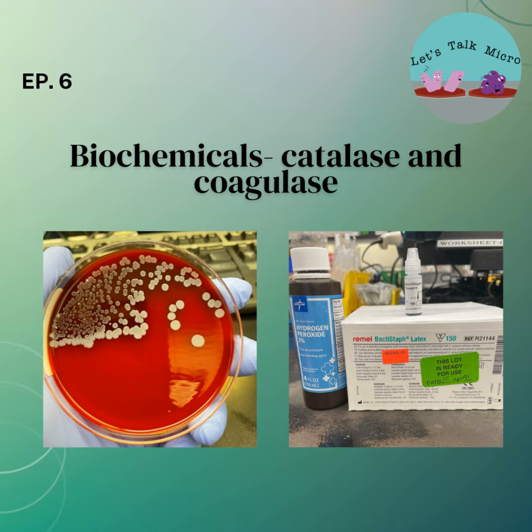So I know most of you out there tend to be the visual type. So flow charts are always very helpful when you're dealing with these biochemicals. If you were doing a flow chart of your gram positive cocci, catalase will be at the top. That's the first thing you do. You do a catalase result.